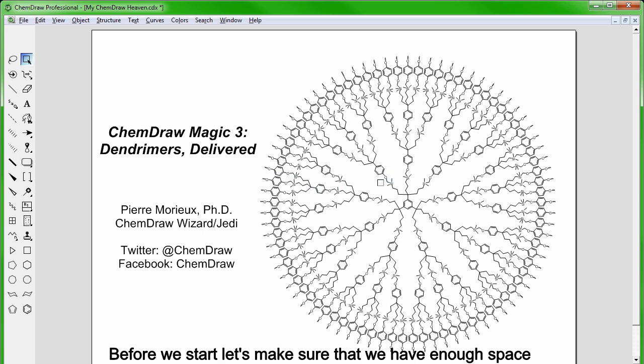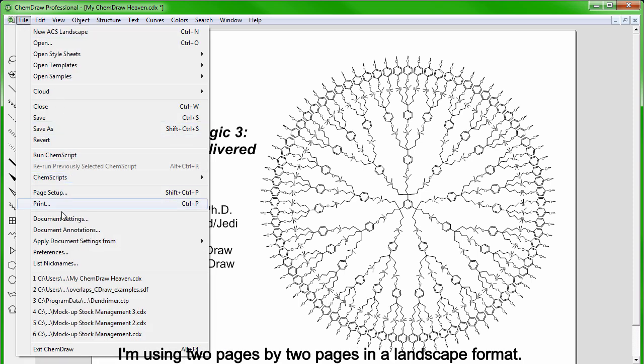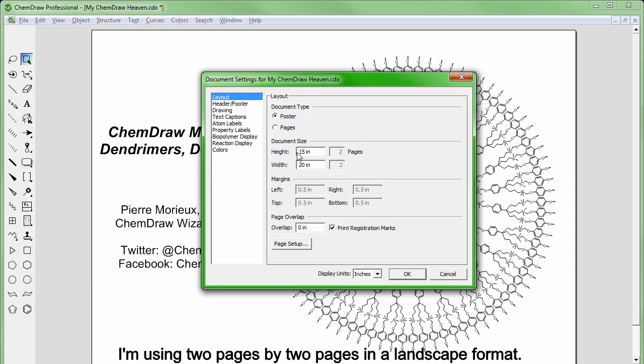Before we start, let's make sure that we have enough space for the drawing. We can see in the document settings, I'm using 2 pages by 2 pages in a landscape format.